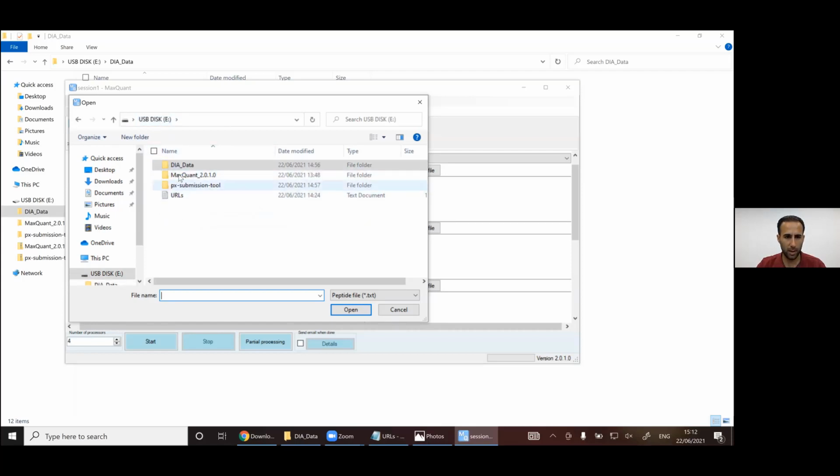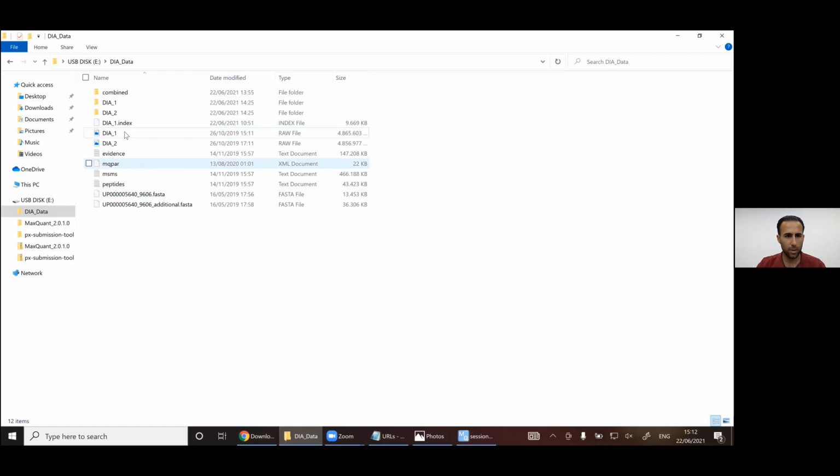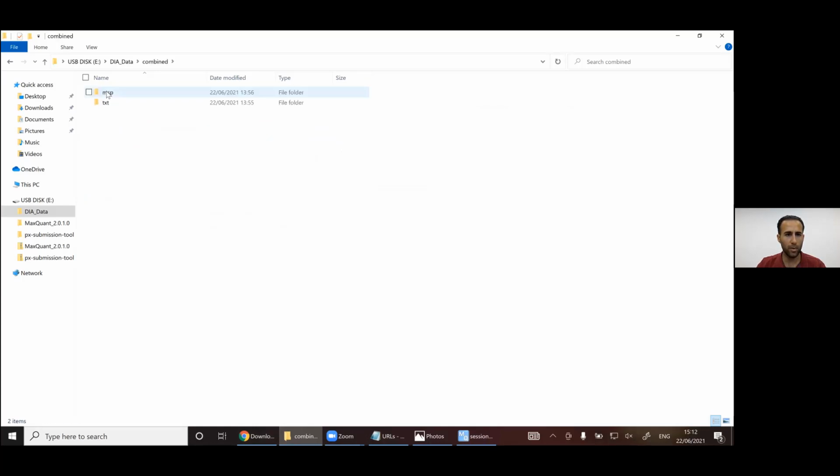And that usually lies in your combined folder. Just ignore this DIA here. Think of it as the DDA run.